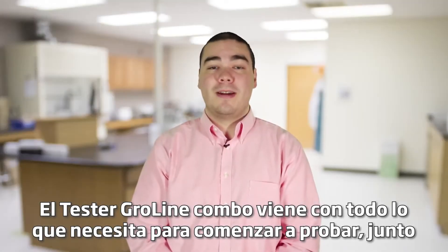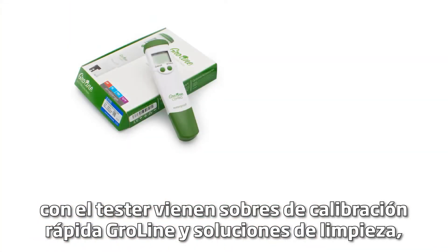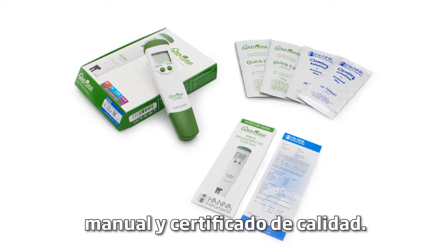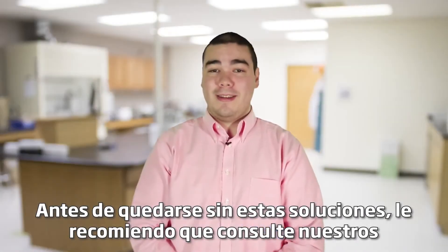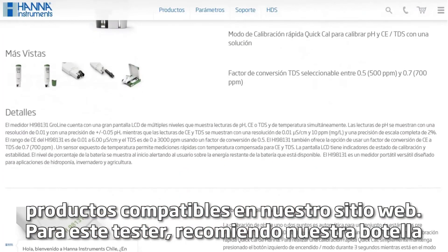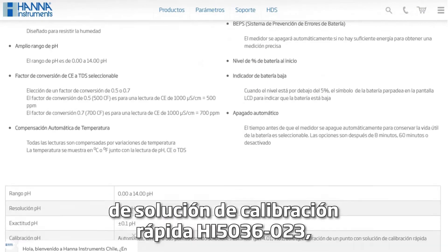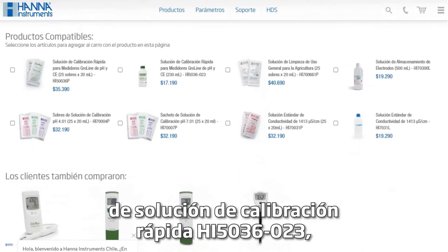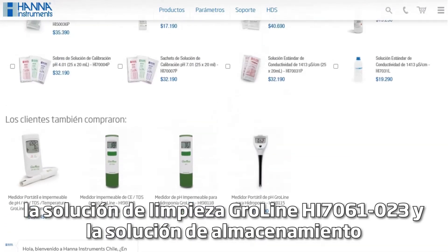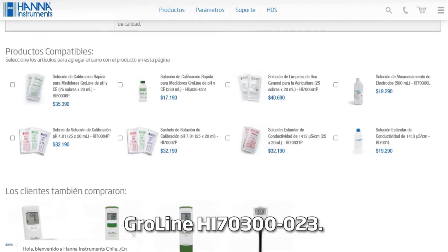The GroLine combo tester comes with everything you need to begin testing. Along with the tester comes our GroLine quick calibration and cleaning solution packets, manual, and quality certificate. Before running out of these solutions, I recommend you check out our compatible products on our website. For this tester I recommend our HI5036-023 bottle of quick calibration solution, the HI7061-023 GroLine cleaning solution, and the HI70300-023 GroLine storage solution.